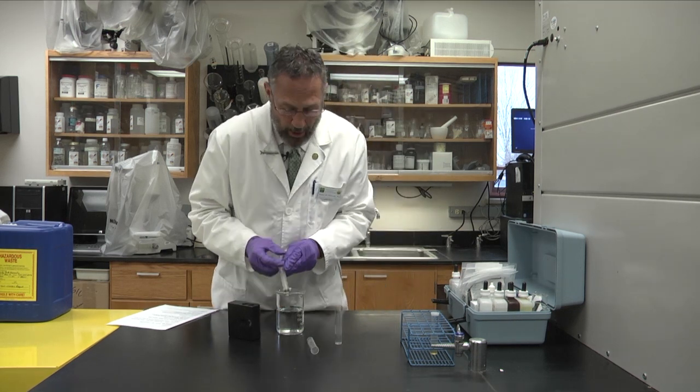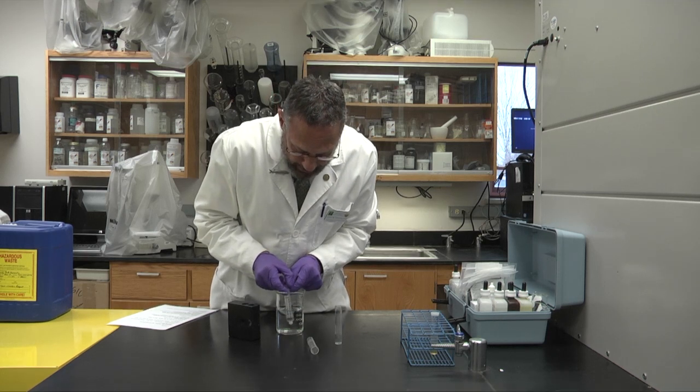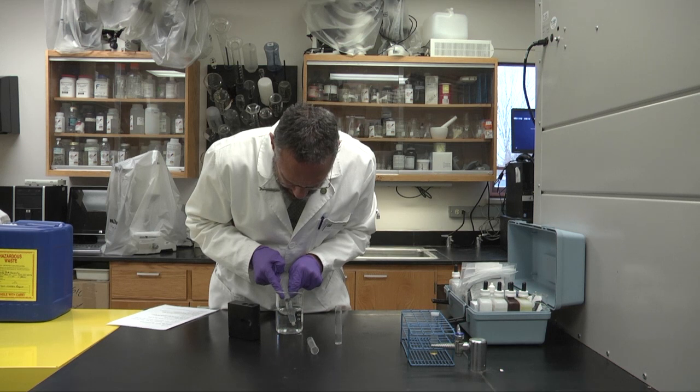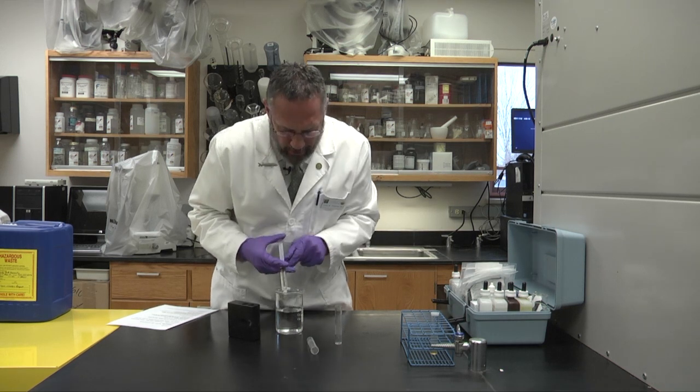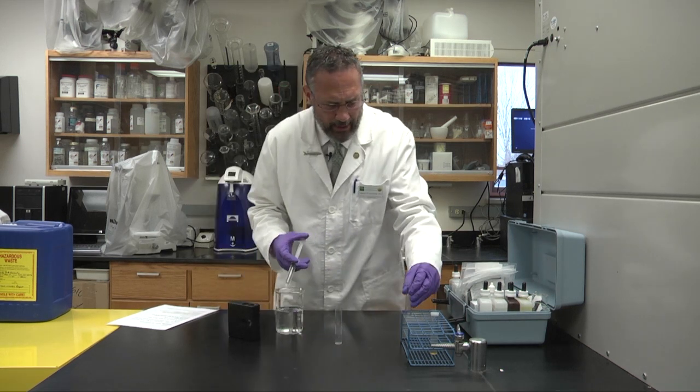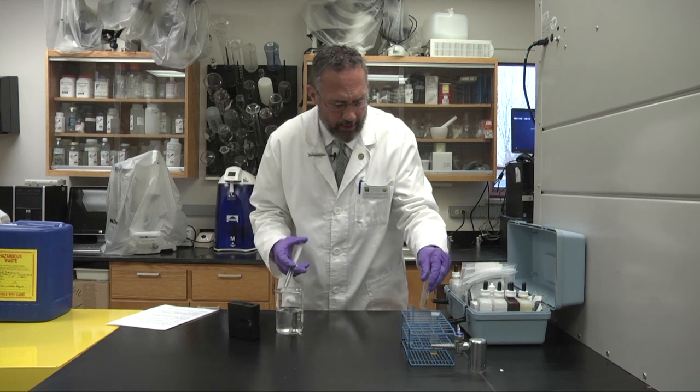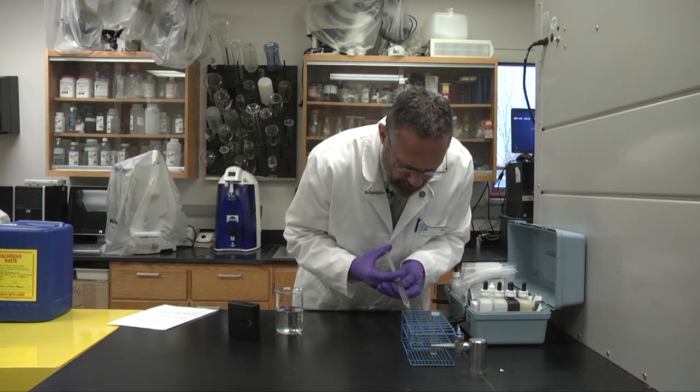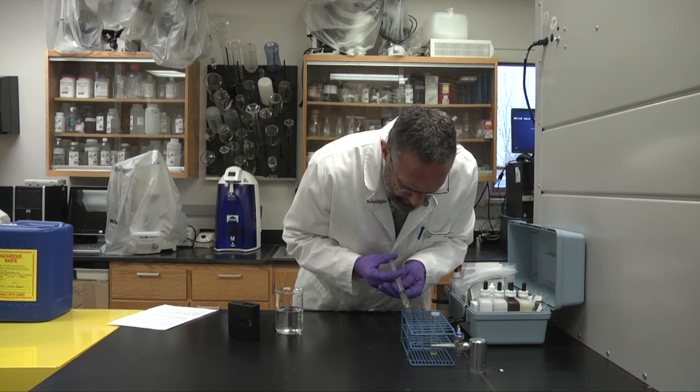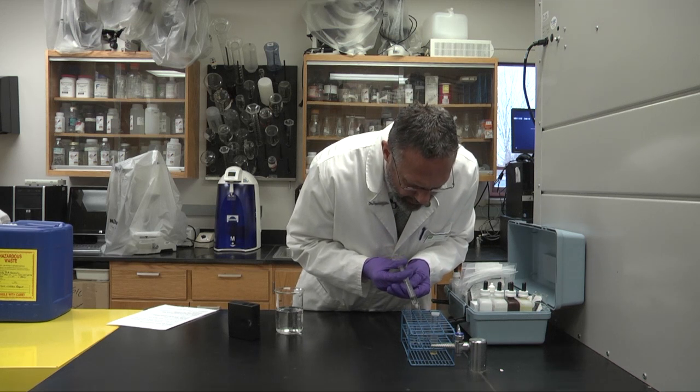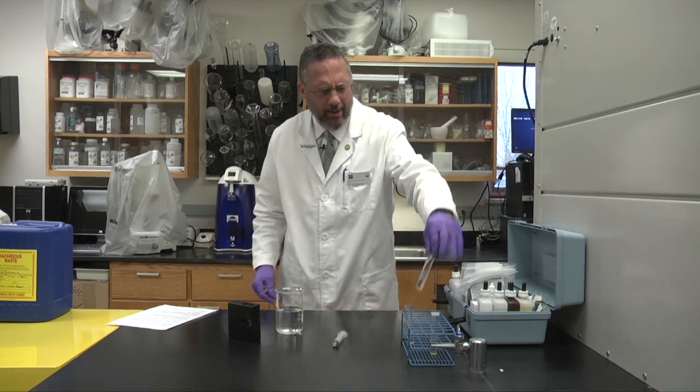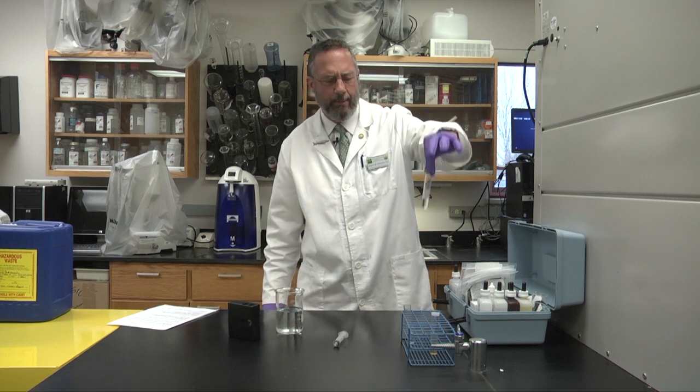So when we're filling these tubes, we'll fill the syringe up to ten cc's or ten milliliters. Put them in the test tube rack here and we'll put five cc's or five milliliters in one tube and five cc's in the other tube, and one of the tubes we won't add anything to. We'll leave it blank.